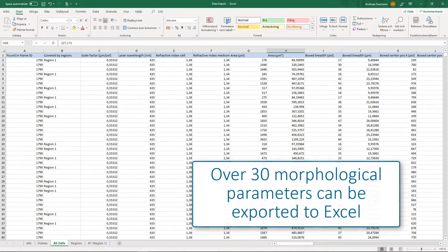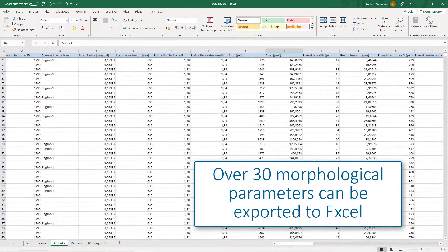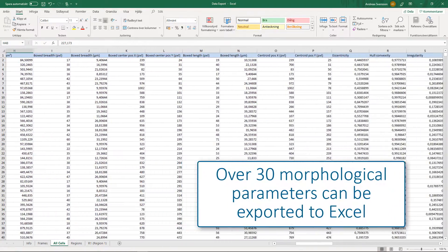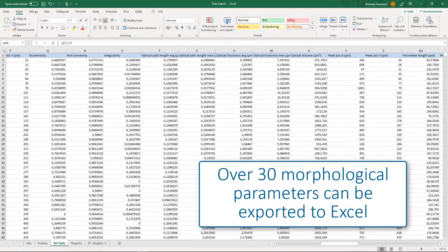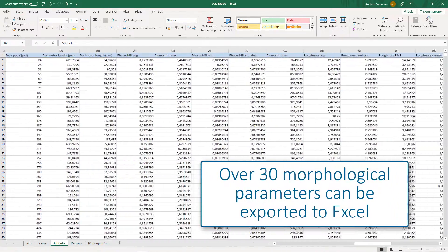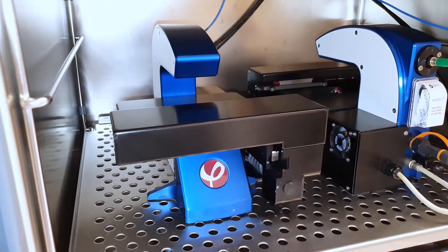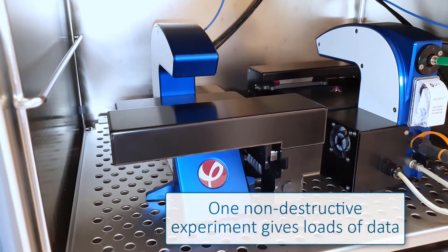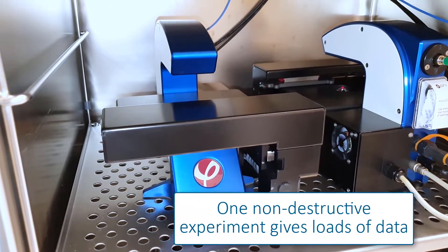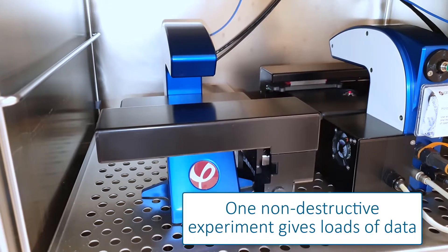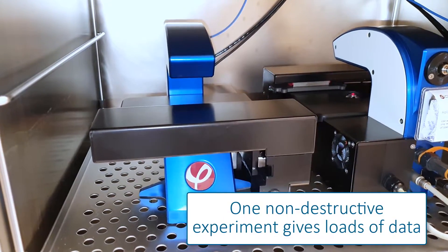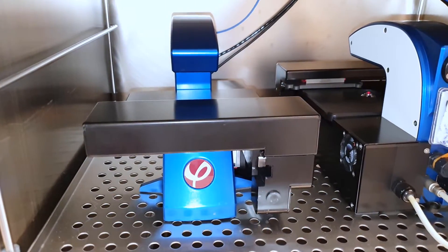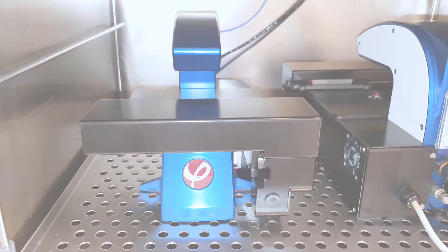All of these parameters can be exported to an Excel file if you want to analyze the data further on your own. With Holomonitor, you save both time and money by getting all necessary drug effect data from one single experiment without wasting any cells.